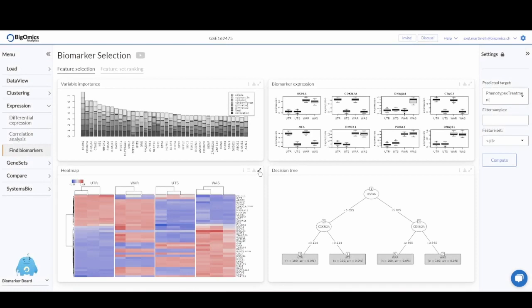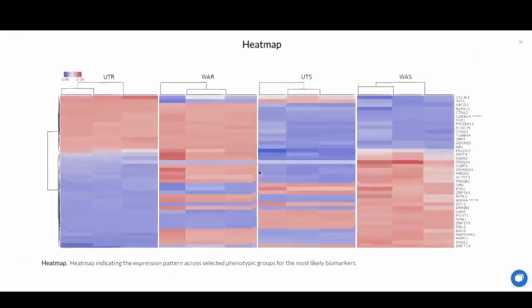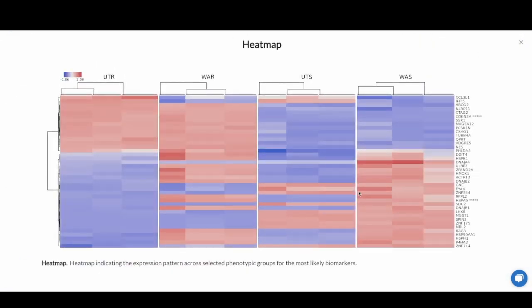Next we have a heat map that shows the most prominent potential biomarkers and their expression level across all the samples.